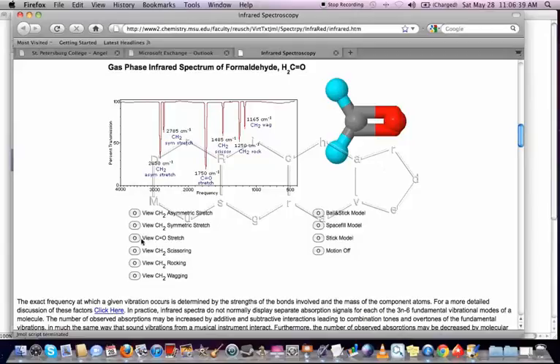Let's take a first look at the C double bond O stretch. There we go. This is going to be caused by infrared radiation of a certain frequency, and it's around here, about 1750. The unit we use here is centimeters to the minus one, which is called wave numbers.